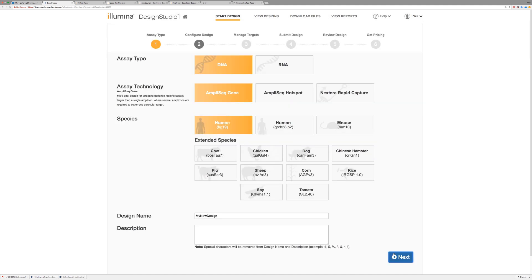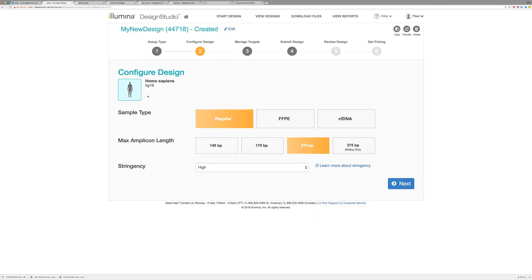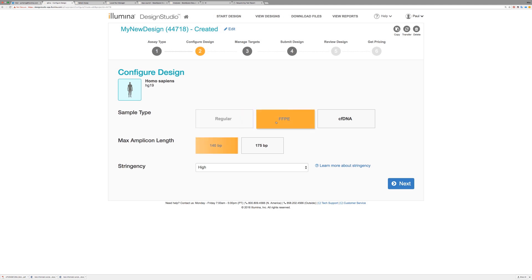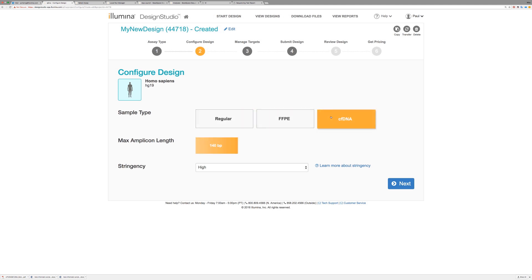Next, configure your design to specify a sample type and a maximum amplicon length. Here, we're selecting regular DNA samples, but FFPE and CFDNA sample types are also supported.